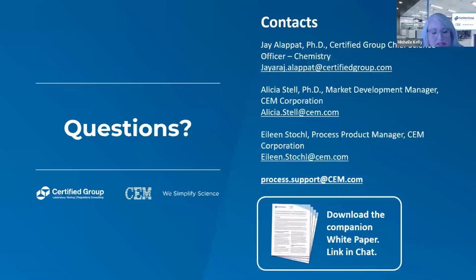We do have a few questions in the Q&A section, and we also have a few questions that were sent in prior to this presentation. So I'll start with the Q&A questions. Just keep in mind if we don't get to your question that we will respond to you and get you a personalized answer. The first question is the NMR time, 3 to 5 minutes. Does this include the drying step?